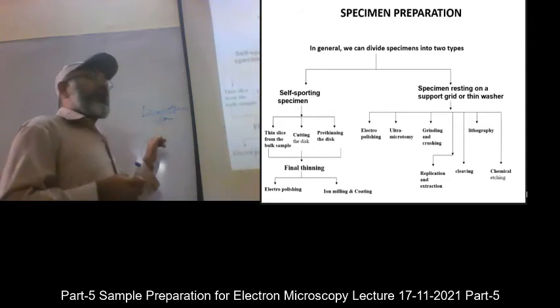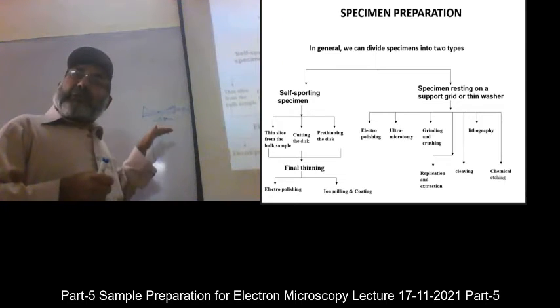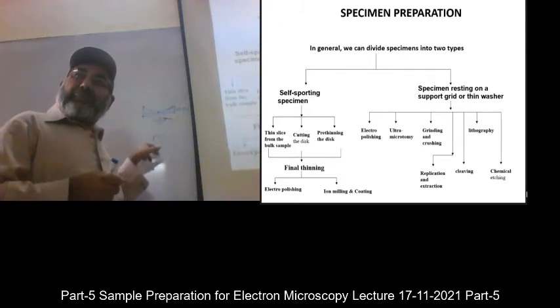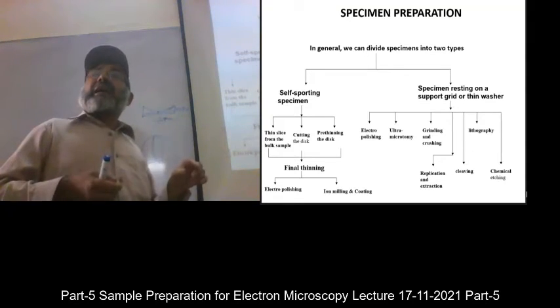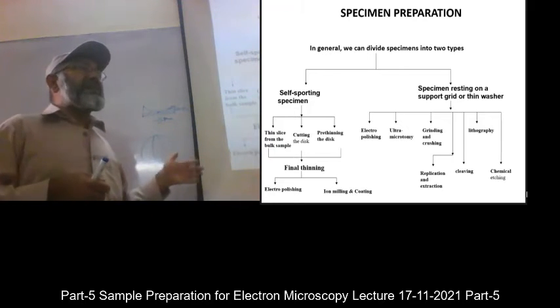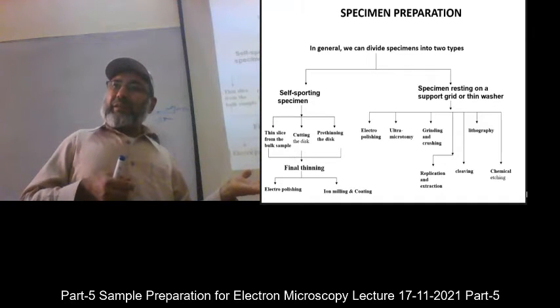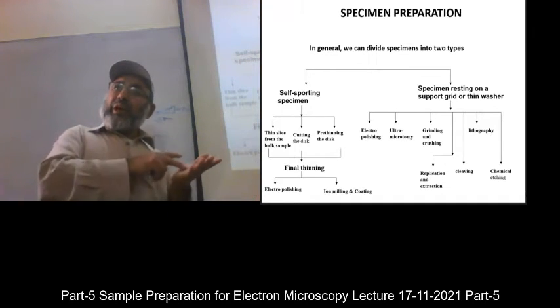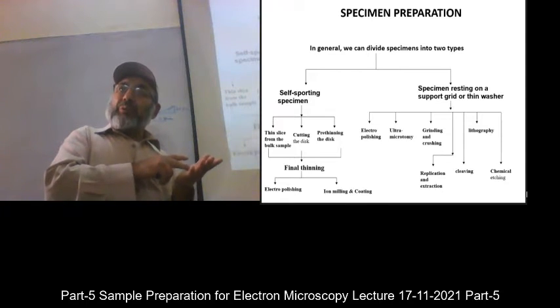So there will be no rough lines or scratches of the wheel in the dimpled area, because a scratch can damage the sample very badly. And secondly, the sample will appear very ugly when you put it in the machine. So that is why the cloth and the diamond paste are very, very important there.